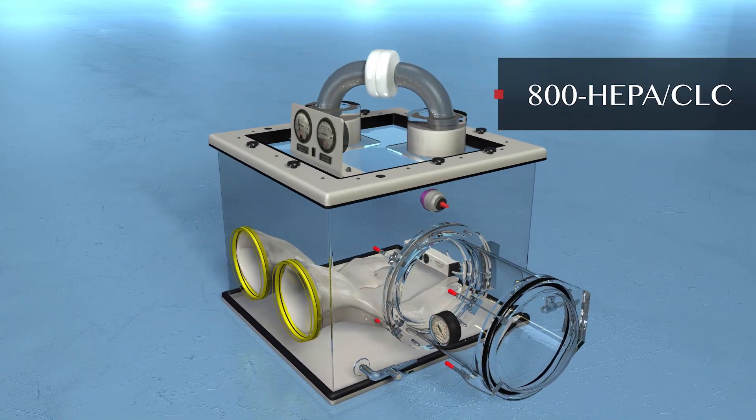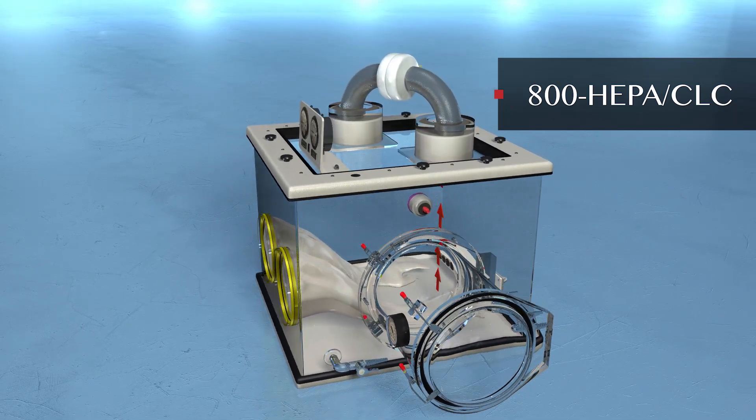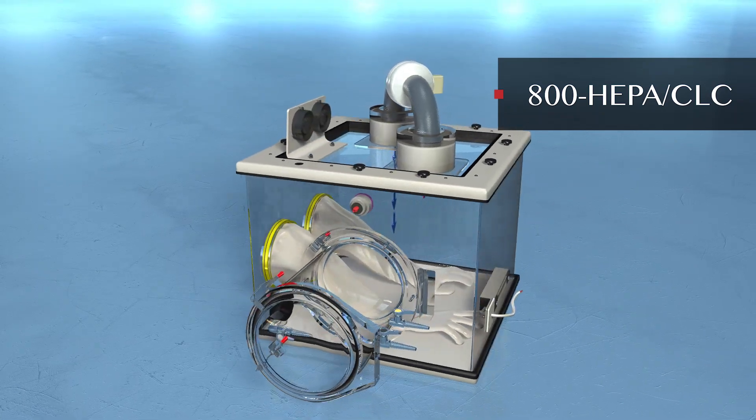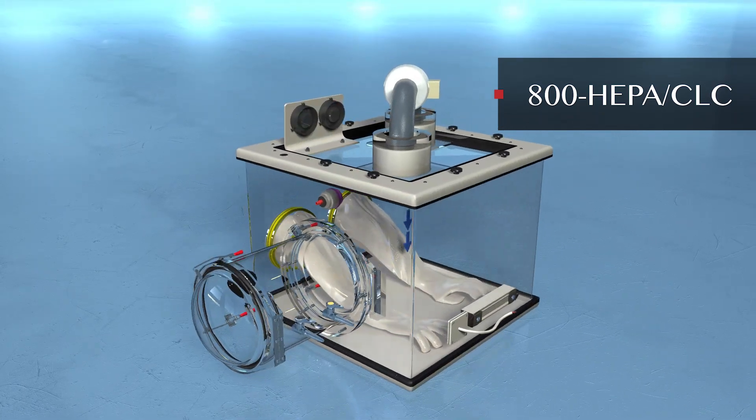800 HEPA CLC. Double HEPA filtered closed loop filtration system continuously circulates the internal atmosphere through two 8 inch round HEPA filters.